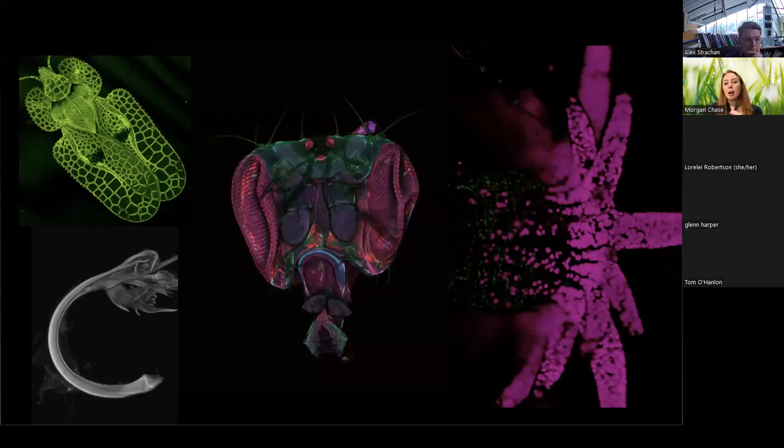So this is from our confocal microscope. These microscopes are not unlike what you could use in your biology classes. There's a focal plane, there's a stage, we can put a slide on top, and then you can use an eyepiece to view it. This one costs a lot of money because there are lots of extra bells and whistles, like the fact that instead of visible light, you can use lasers and learn something about the fluorescence properties of some of these animals.